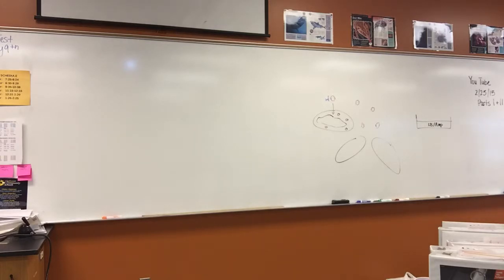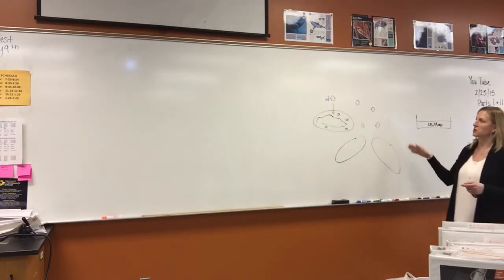Which bacteria are the only ones that are going to grow on that? They're the ones that took in the recombinant gene, and so therefore it's a way to weed out bacteria, to separate them out, okay? And that's what the ampicillin is used for.